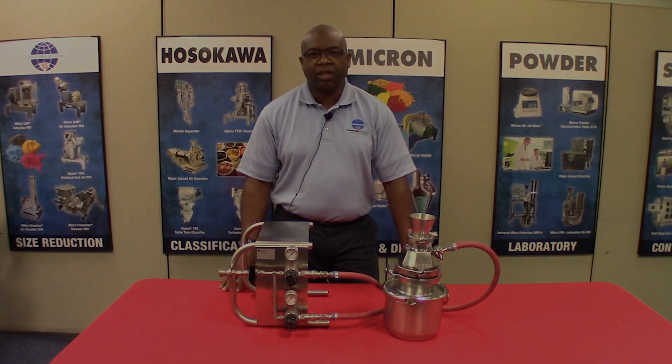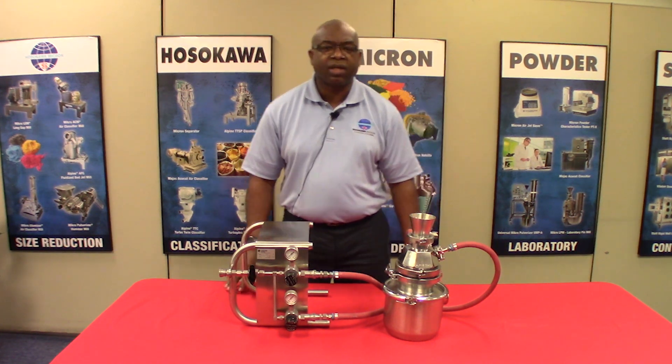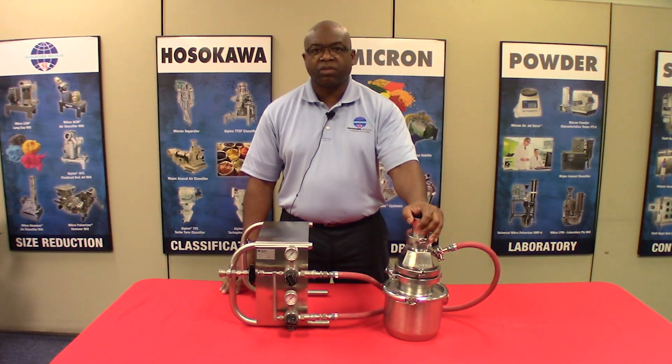My name is Lloyd Sutherland. I'm an applications engineer here at Hosokawa Micron Powder Systems in Summit, New Jersey. I'd like to introduce to you today our 50AS spiral jet mill.